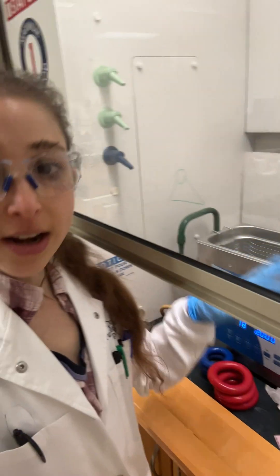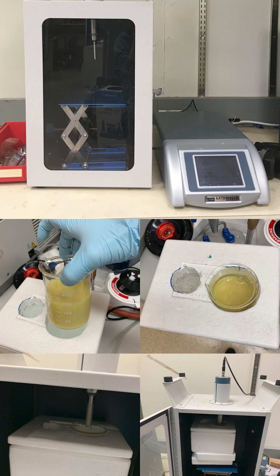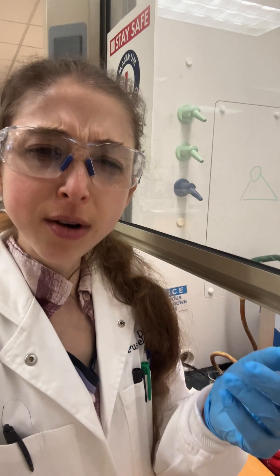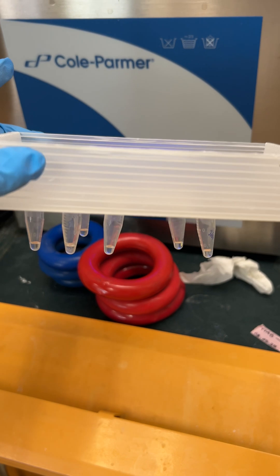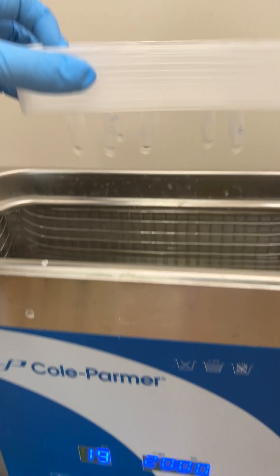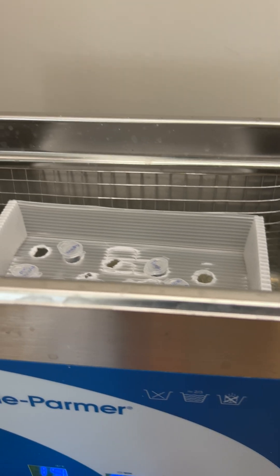This is a bath sonicator, really good for dissolving solids. We also have probe sonicators, which have a probe that sends out really intense ultrasonic waves — those are great for protein purification, cell lysis, and DNA shearing. Today we're using sonication for dissolving solids. I also learned you can use the sonicator to unclog needles, but hopefully it won't come to that.